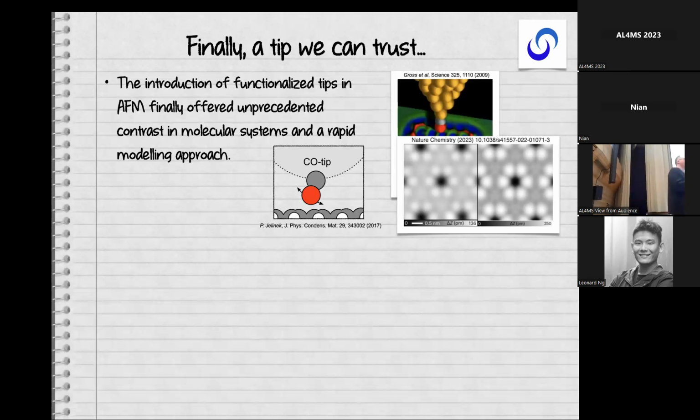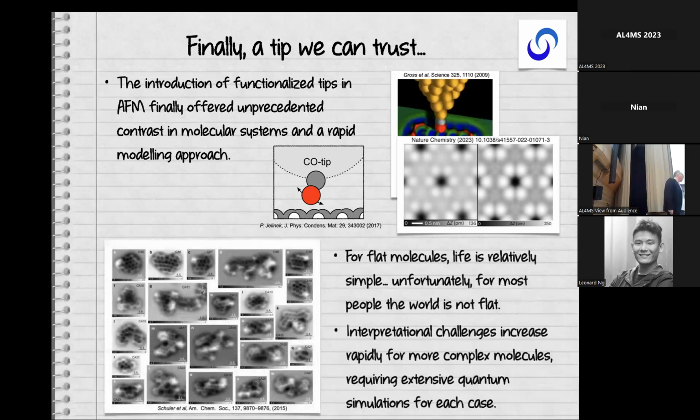machine learning. Because most often we're not interested, or at least I am not that interested, in the simple systems like this flat molecularly assembled material. What happens if we have very complicated molecules which are not necessarily flat, which have not been carefully synthesized? This is actually an oil just thrown on a surface at IBM. What actually are all these molecules? Is there anything interesting or not?